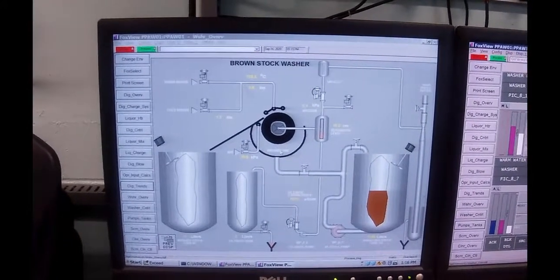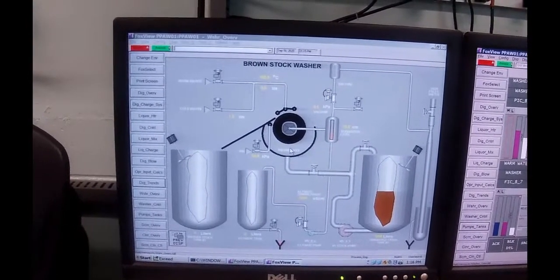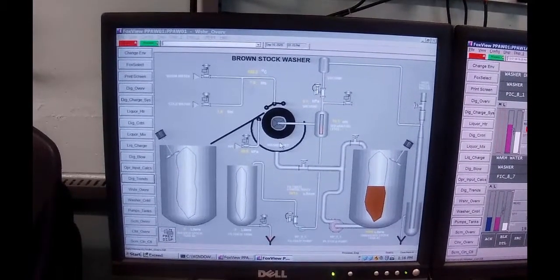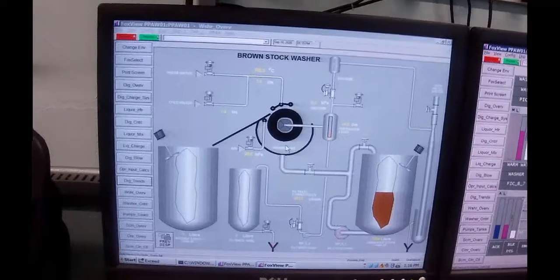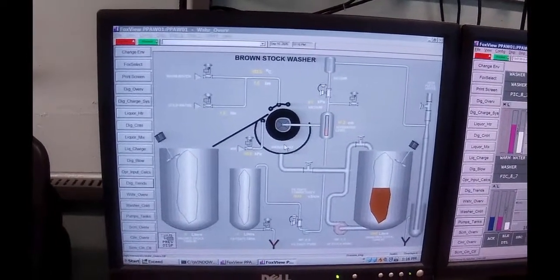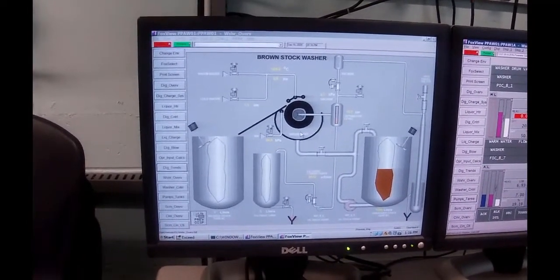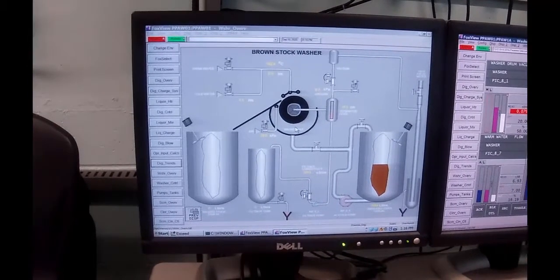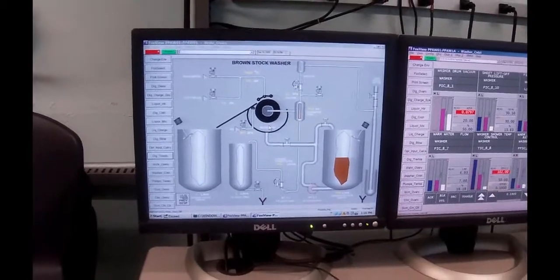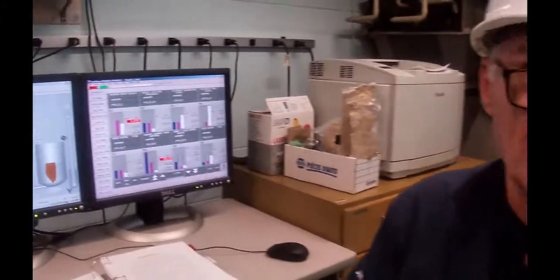It's somewhat manual. We've got a lot of playing around to do and trying to get the sheet on the wire itself. Understand that this little guy that you just looked at is a model compared to the real. The real machines are up to 10 meters long and probably about 3 meters in diameter. So they're significantly larger. We were told at the very beginning that this little demonstrator would never work, but it does work if you play with it a lot.